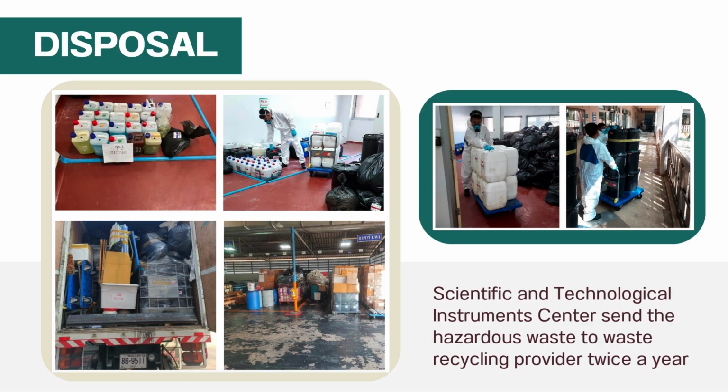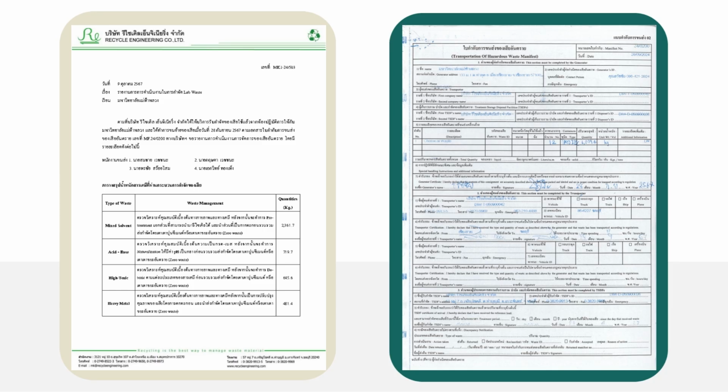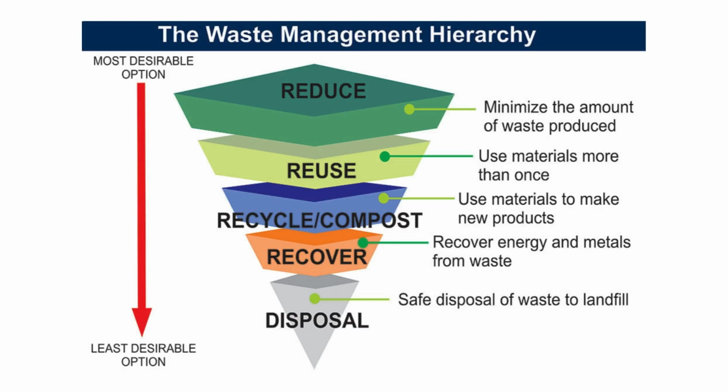For the final step, we send all hazardous waste to a licensed recycling or disposal company. This happens twice per year and ensures that waste does not remain in storage for too long. Safe disposal is the final responsibility of the waste generator and the university.